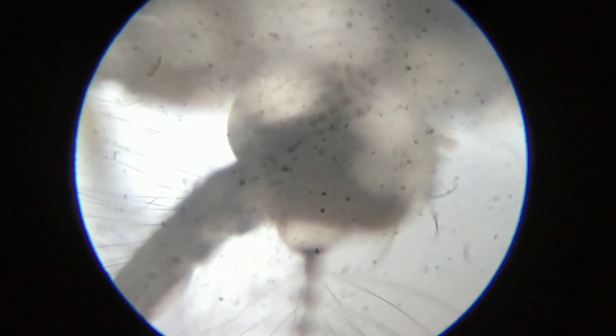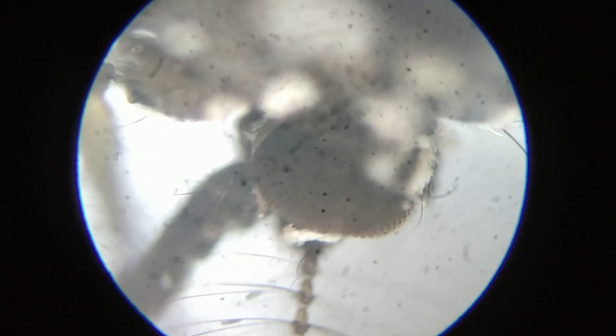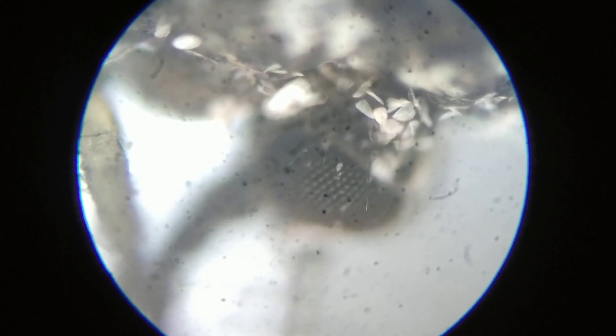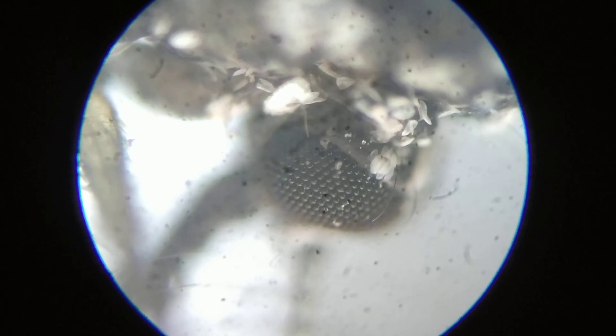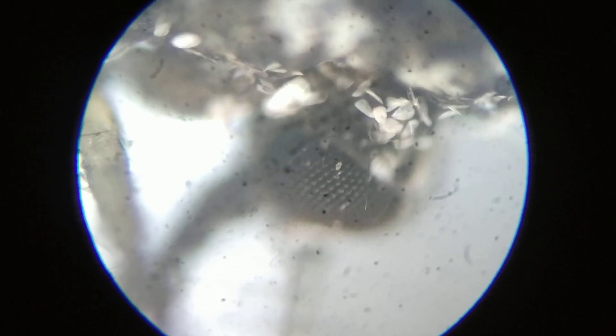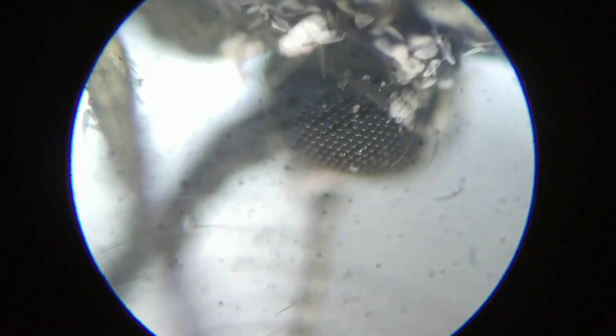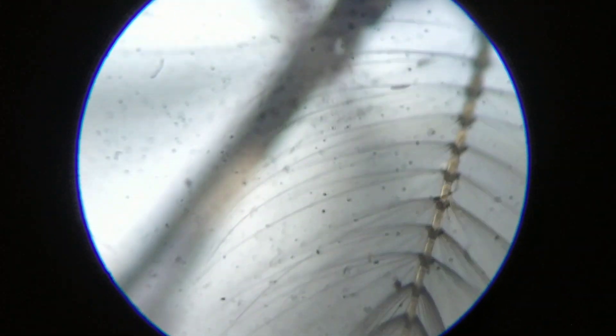As you can see, this is the head of the female Anopheles mosquito. On the two sides, you can see the compound eyes with many lenses inside. It has two compound eyes, and this is the sucking mouth part that it uses to suck blood.